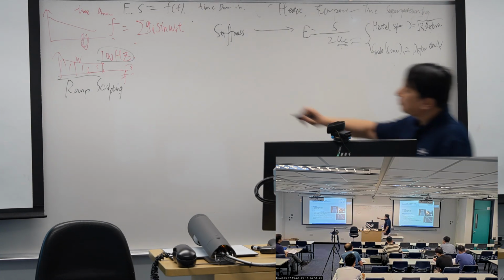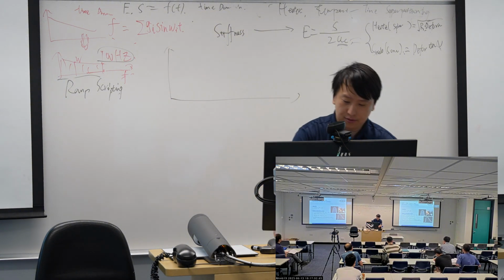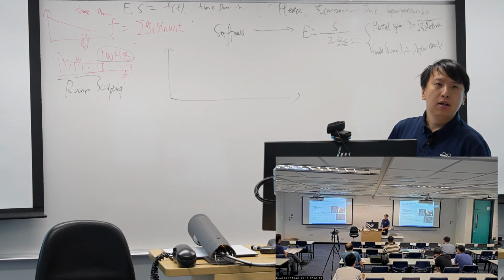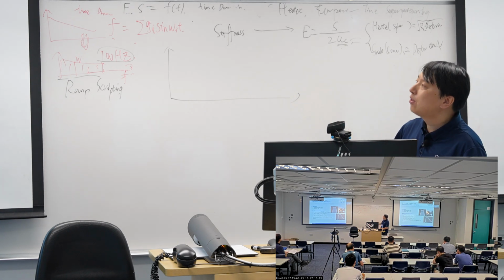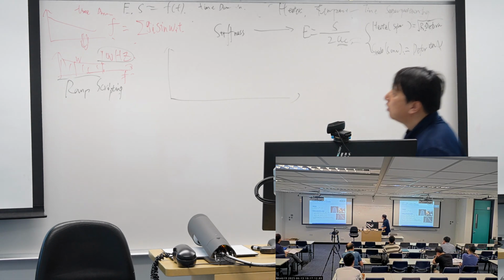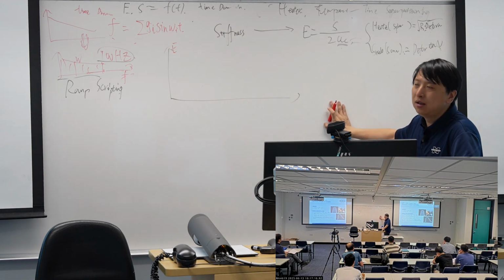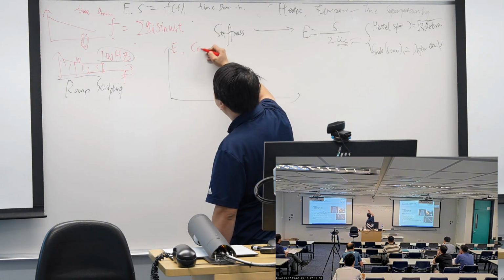But we know our stuff. We know we are facing polymer material. We are facing viscoelastic materials, so its modulus will change. In other words, the sample itself has creep.